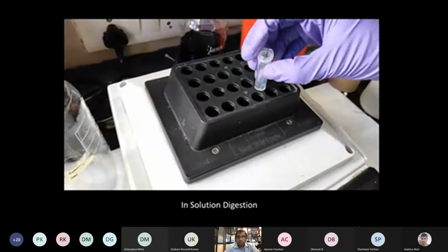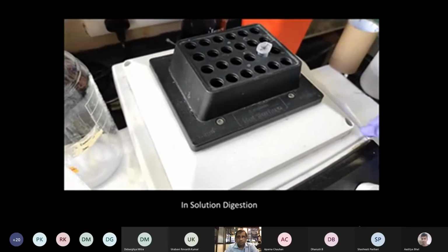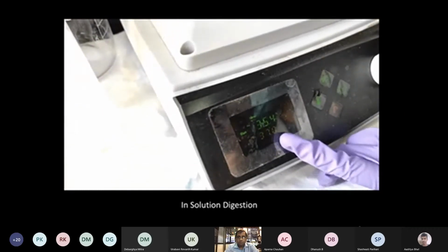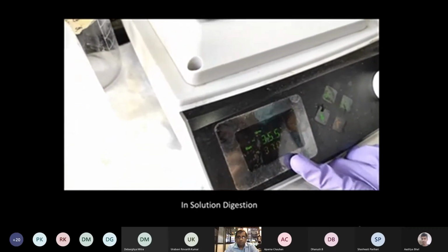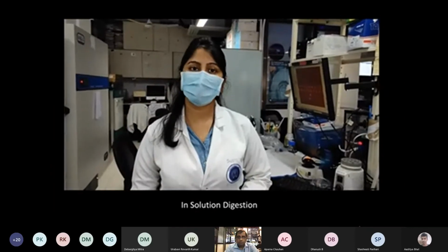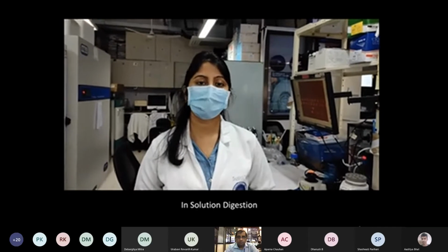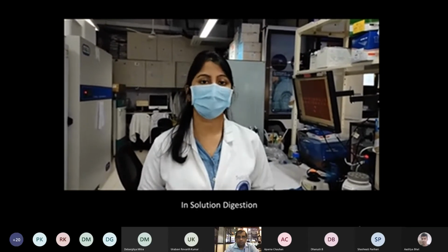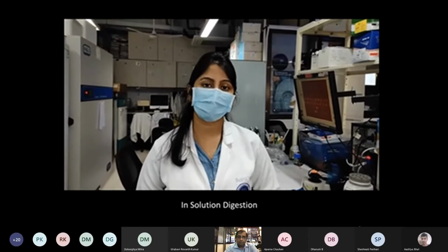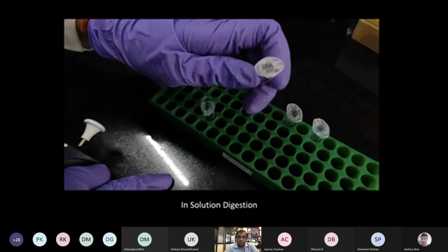After addition of TCEP, the reducing agent, it should be incubated at 37 degrees for 1 hour. After incubation at 37 degrees, the samples would be reduced, which means all the disulfide bonds within the proteins are broken. So now it's time to alkylate the sample. For alkylation, iodoacetamide is used.